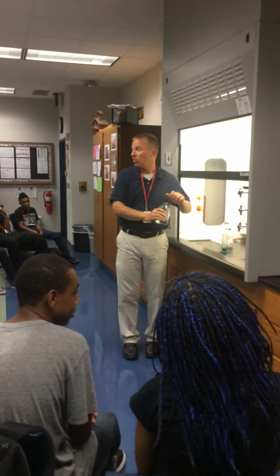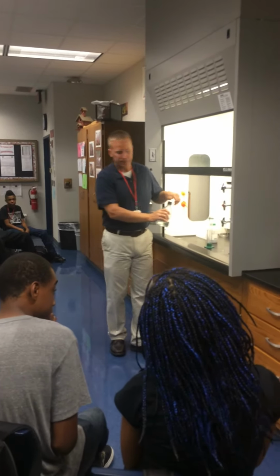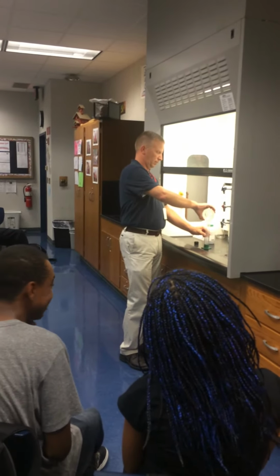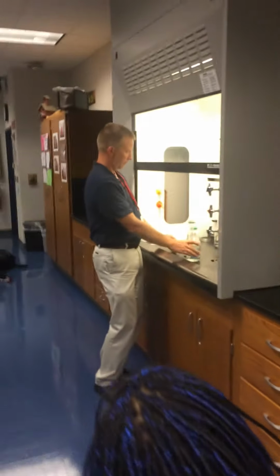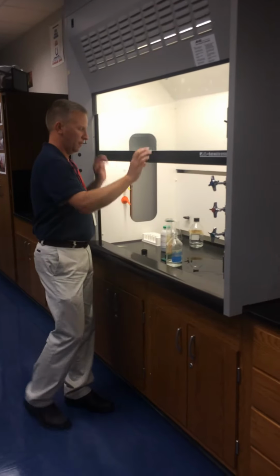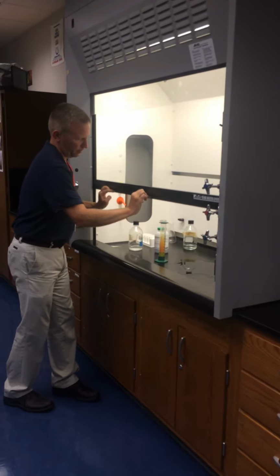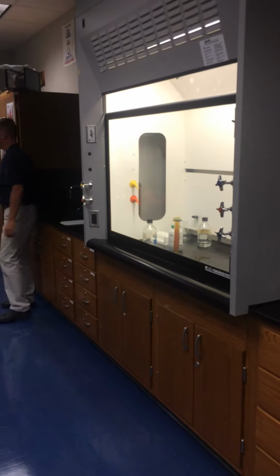Okay. We're going to take this acid, and we're going to put it into the graduated cylinder. Getting back on track here a little bit. We're going to take Abraham Lincoln, and we're going to put him in here too. Watch the liquid. Oh, God. Watch the liquid.